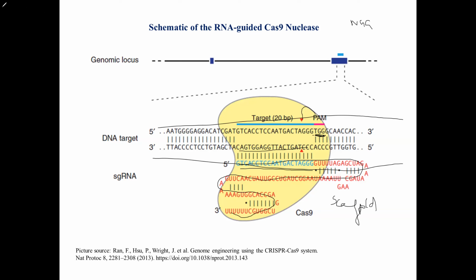That means in the target DNA sequence, you'll have multiple PAM sequences. NGG could be in multiple places. For example, this is also NGG. Can you see? N could be any nucleotide. This is also NGG, and it can bind here also. But the sequence ahead of it, if it denatures and then tries to anneal, it will not anneal, because your guide RNA is not matched to that one. So it will start moving to the next PAM. It can literally scan the target sequence.